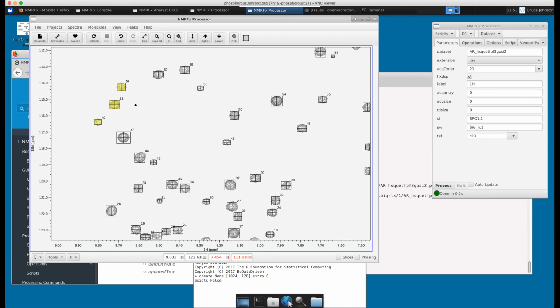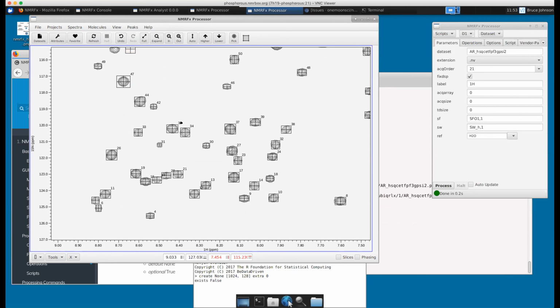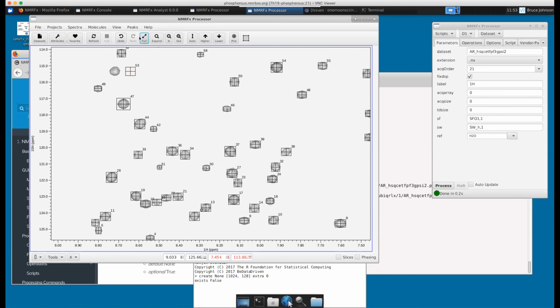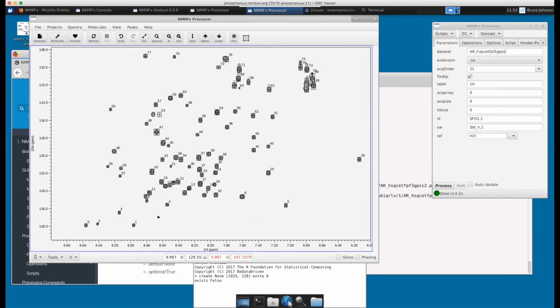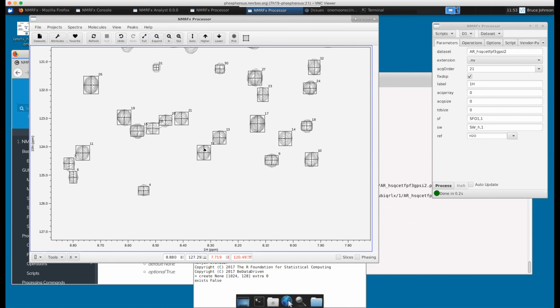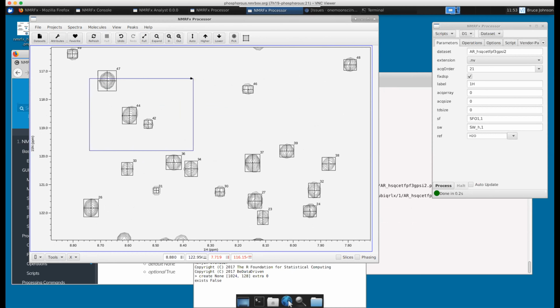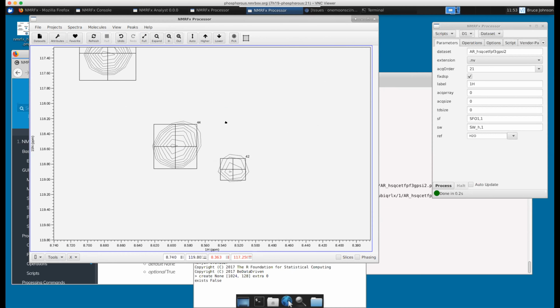If a peak was not picked, and let me see, I know there's a peak in ubiquitin where there's some overlap. Maybe in the side chains, just to see. Well, let's just pretend peak 44 almost looks a little asymmetrical. Let's pretend that there were two peaks there. And we wanted, so the peak picker is very simple.